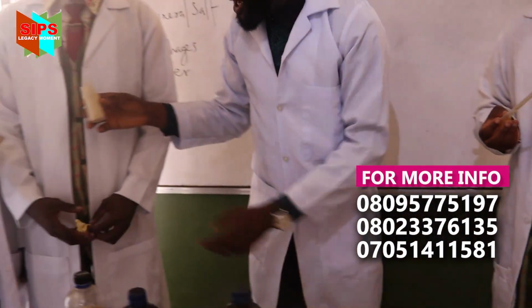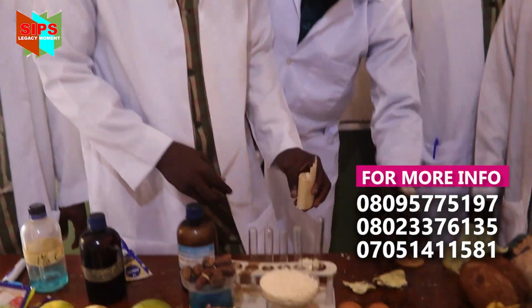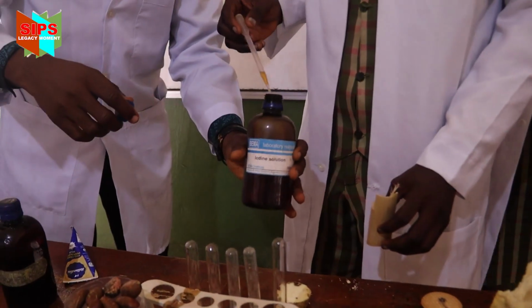Now, the person for sugarcane. Come, use this one. Use the one for sugarcane. Now, give it to him. Add right from our iodine. So let's add it, so we see the difference. Add.